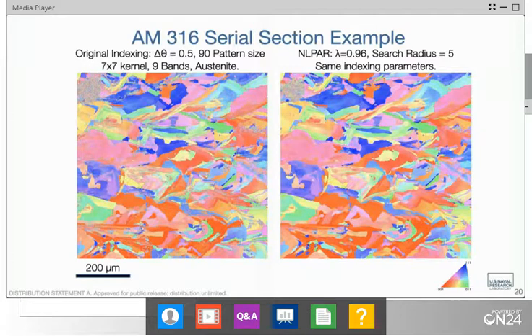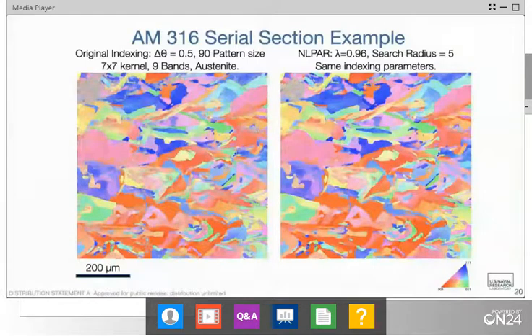Somebody is saying that they are looking at an AM alloy, but there's some black area they're not able to identify. I have no idea. I can't help you with that, I'm sorry. Certainly we see black areas from pores and those types of things. It may be that you're having some kind of phase transformation, might be ferrite that's occurring. Oh, this is maybe an aluminum alloy. Yeah, I'm not sure. I would not have any insight on that.